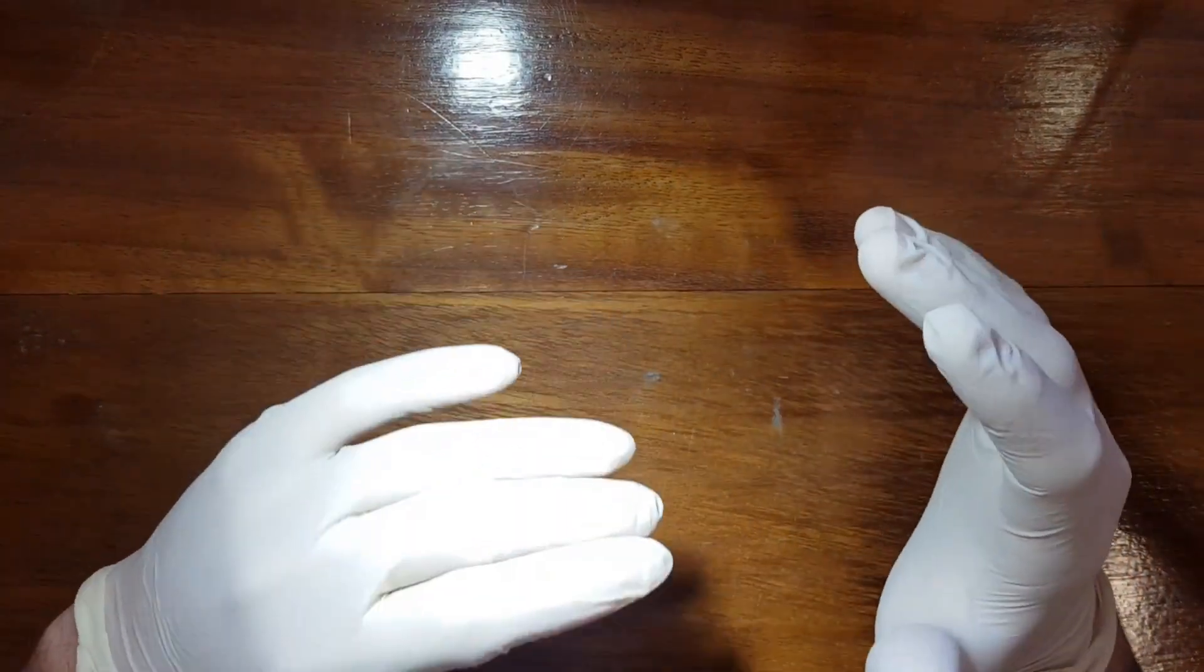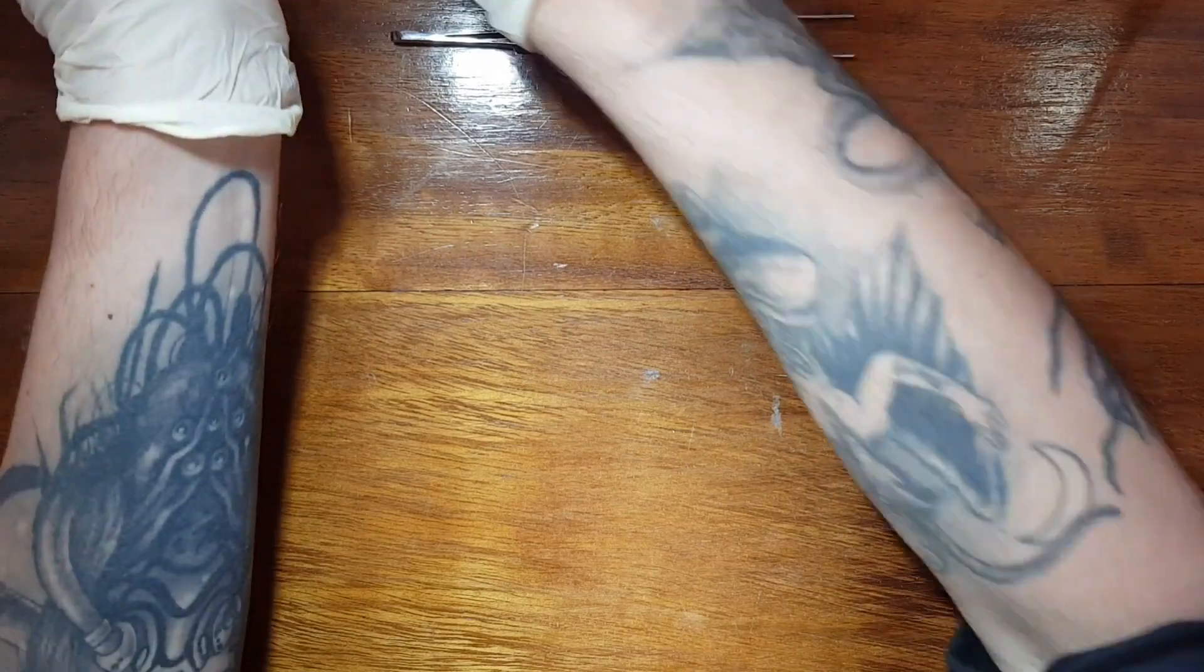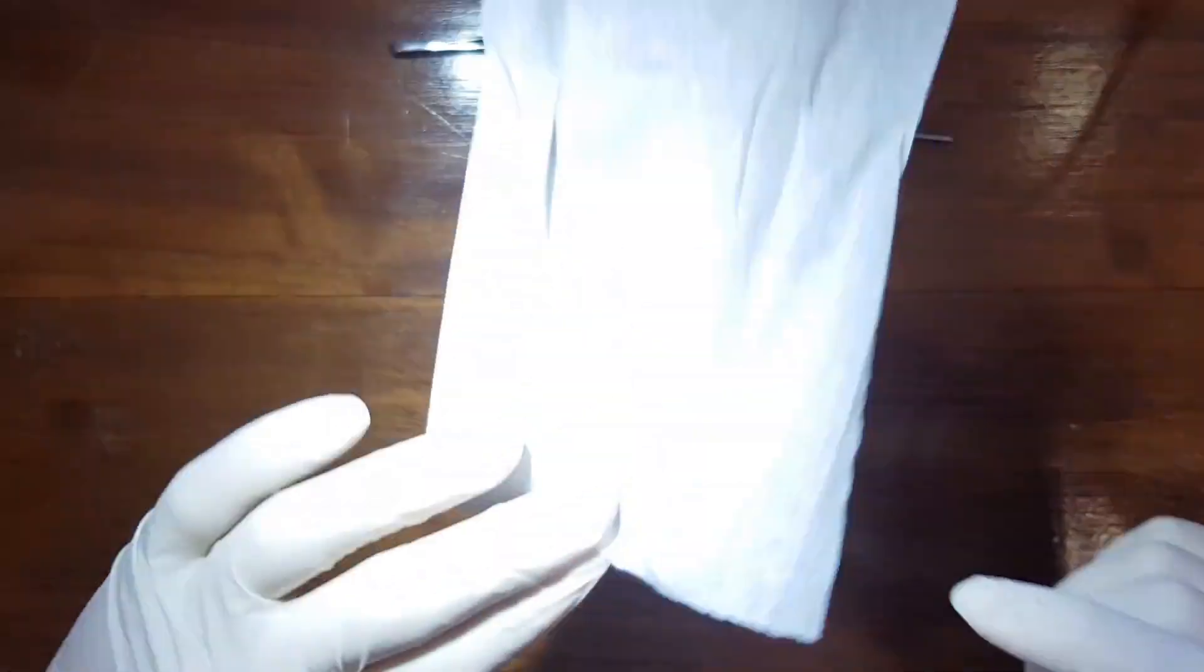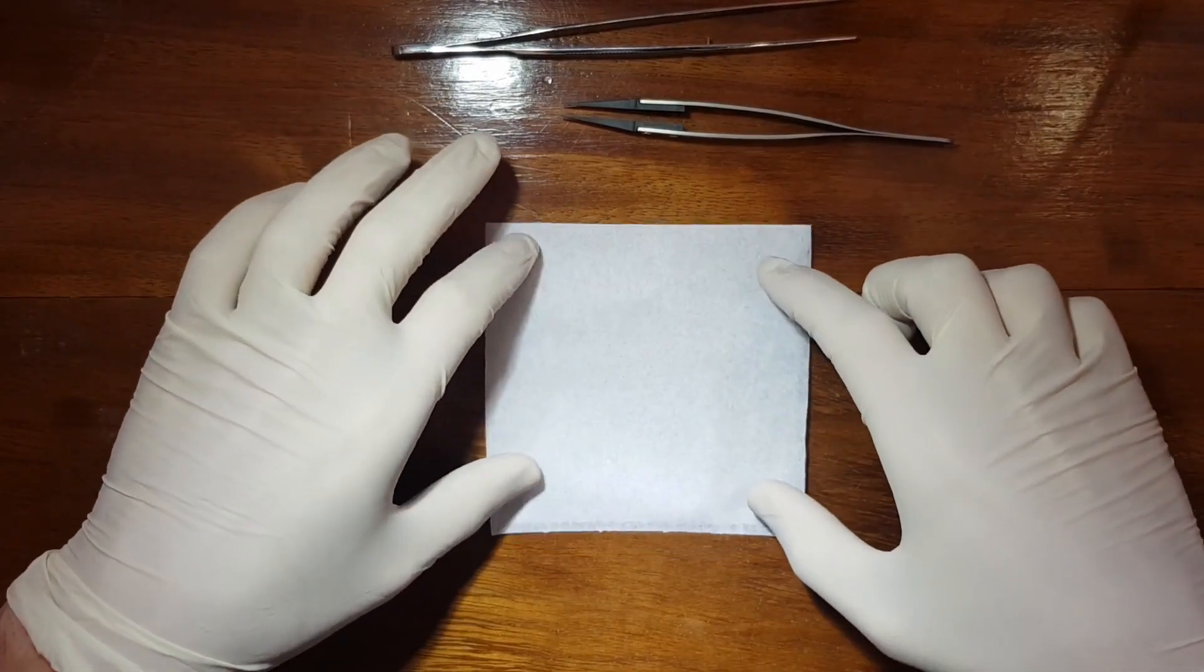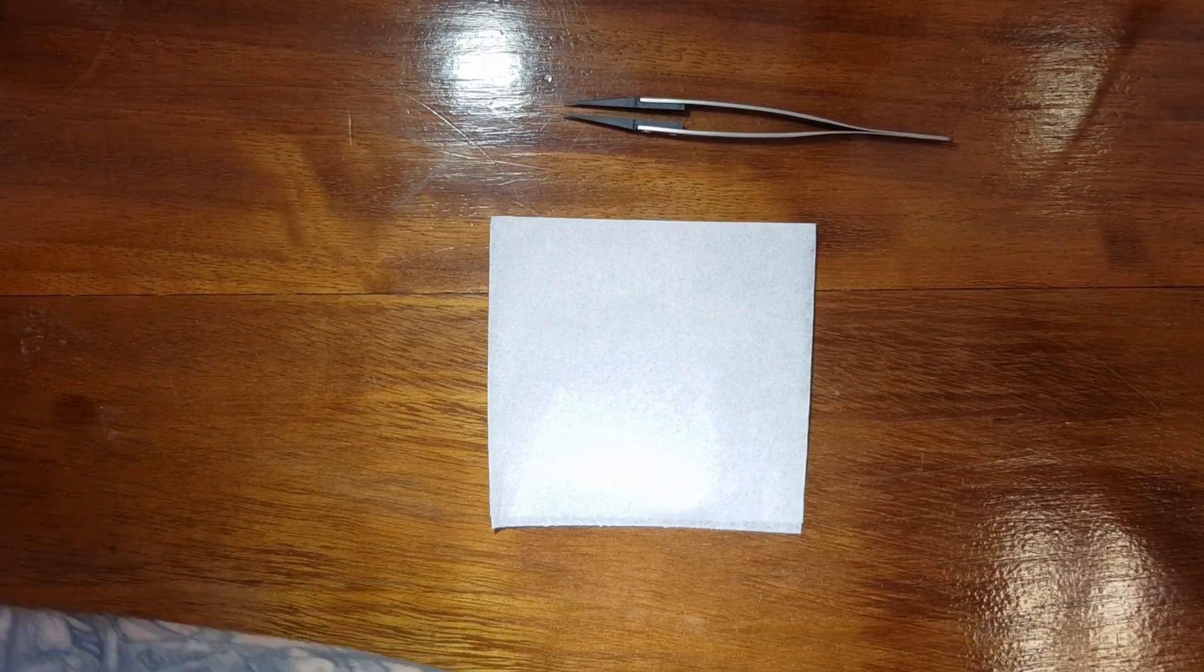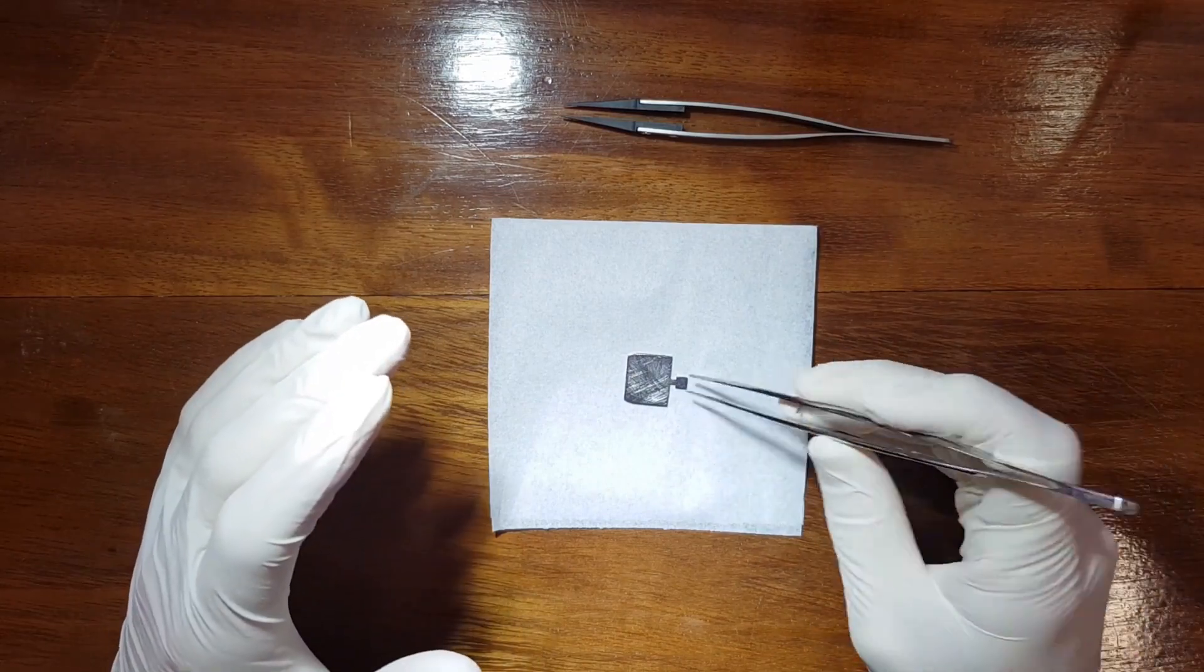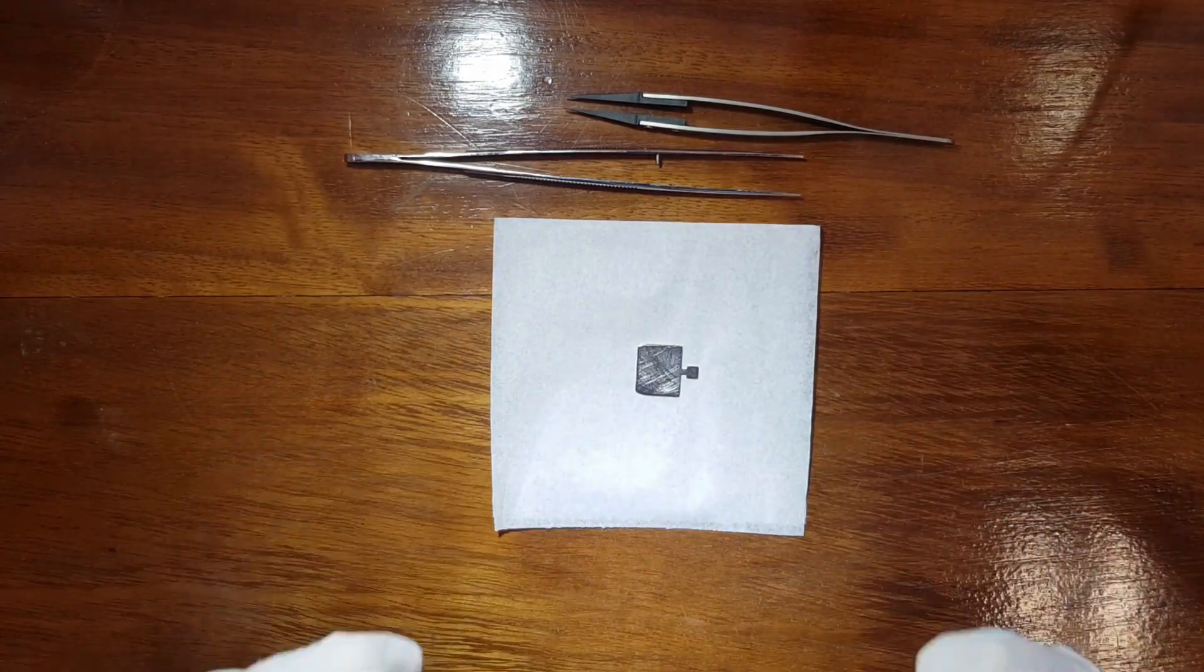Once we're gloved up, we'll need a few tools. First we need usual tweezers, polymer tip tweezers, a kim wipe so we can put our samples on something without touching the table surface. We'll also need a bunch of sample holders, which are these little things right here. These are laser cut stainless steel samples and we'll be mounting samples on there.